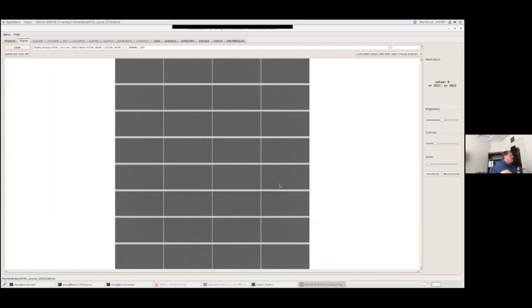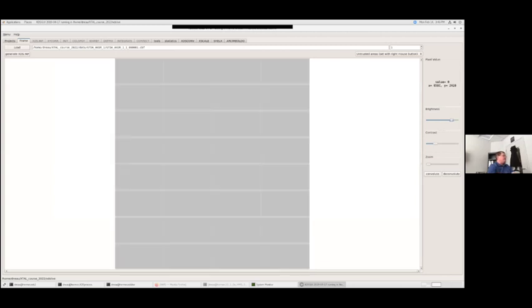So the first thing you want to notice is that this is not the best image for viewing your diffraction pattern. Okay, you can come over here on the right and you can adjust the brightness and you can adjust the contrast, but you're still not going to see very much on here. Okay, and there's a couple of reasons for this. One is it's just not that great of a display for diffraction images, but the real reason is that we're using fine slicing for our images.